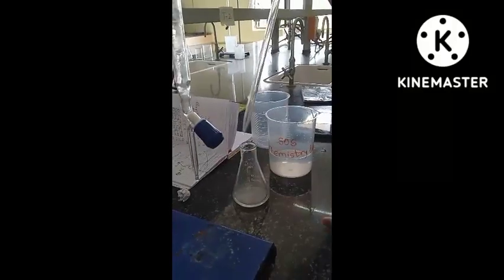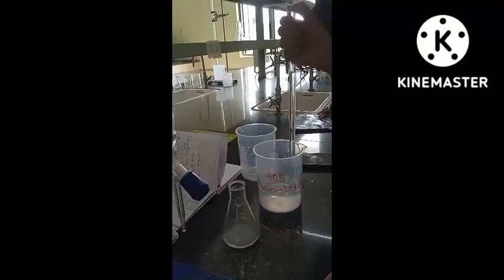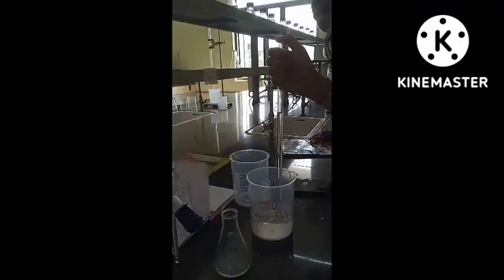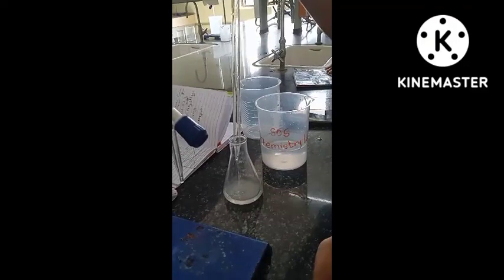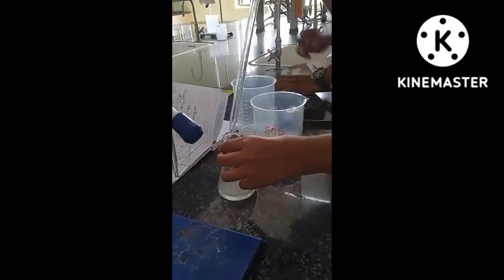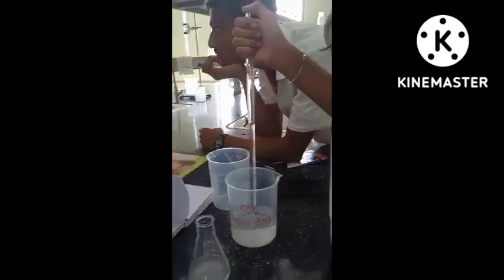So like this we have to do, with the help of a pipette we have to take oxalic acid and keep it in a flask, that is 25 ml. So like this we have to perform until it is 25 ml in a flask.